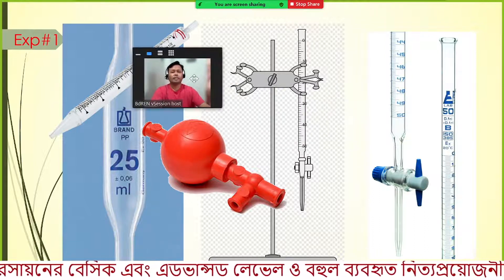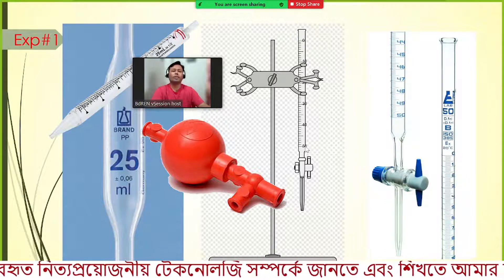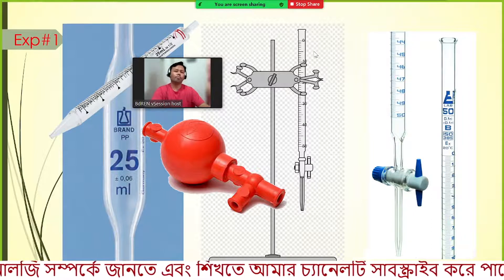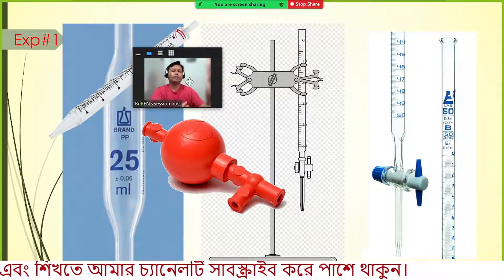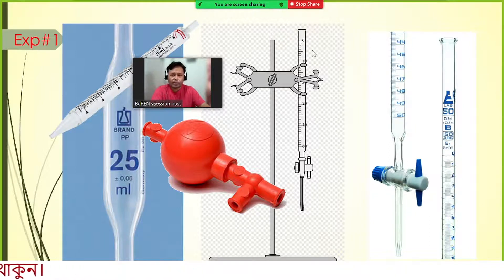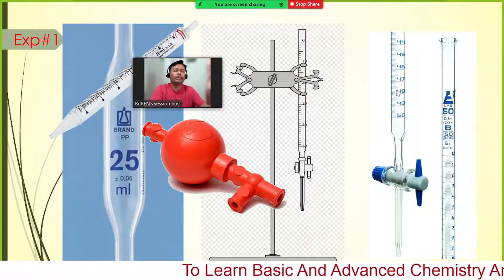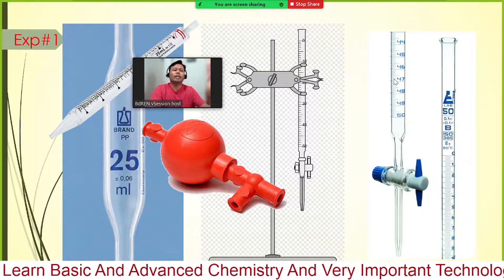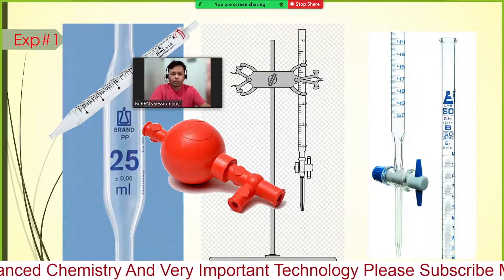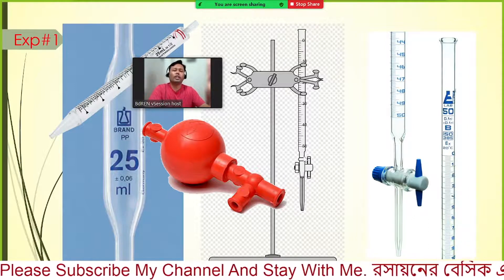The burette has a volume of 50 mL, graduated to 0.1 mL. Between major lines there are nine smaller divisions, so you can read to 0.1 mL or estimate to 0.05 mL. We will place the sodium hydroxide inside the burette because we do not know its concentration and we want the solution color to turn pink, which requires increasing pH by adding base.